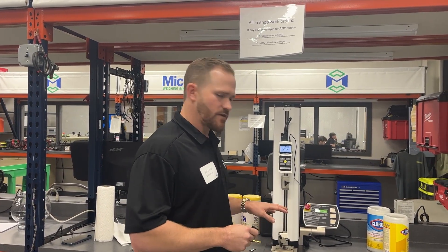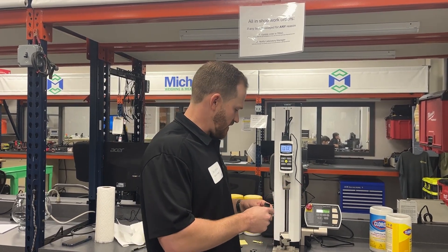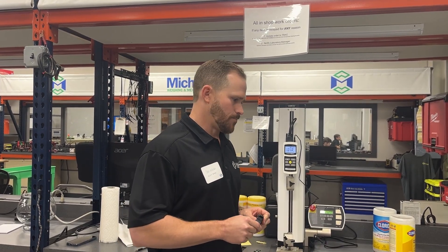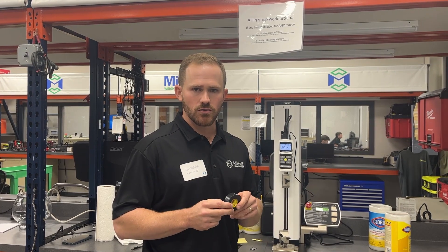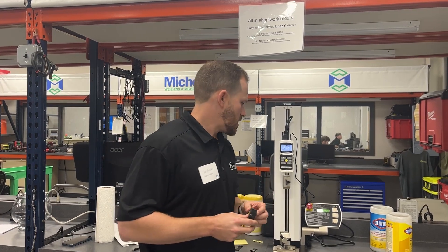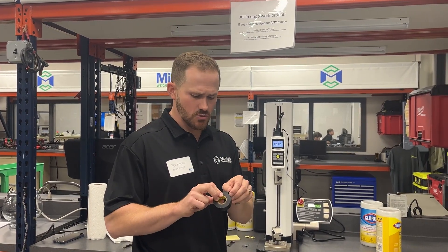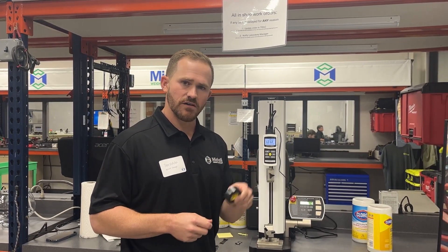This is a way for them to test as they're manufacturing. If they find that their product is out of spec, they can start looking back at their manufacturing processes. They might contact their raw material suppliers, or look at their blending application that makes up the compounds. There's a wide range of investigation they can do, but it all starts at this machine that tells them the strength of their tape.